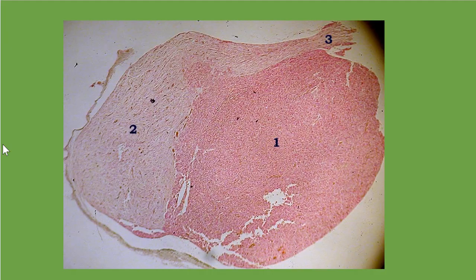And let's look at a couple more. This is a very similar slide to the ones that you would find in the lab. This one, number 1 would be your anterior. This would be your posterior over here.